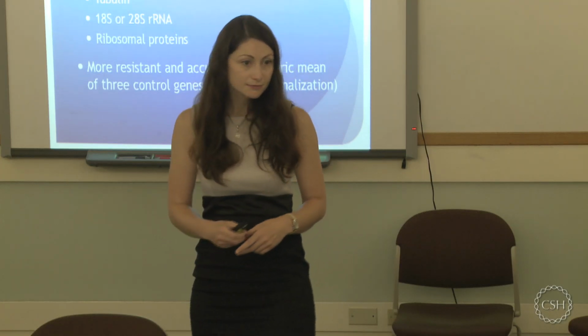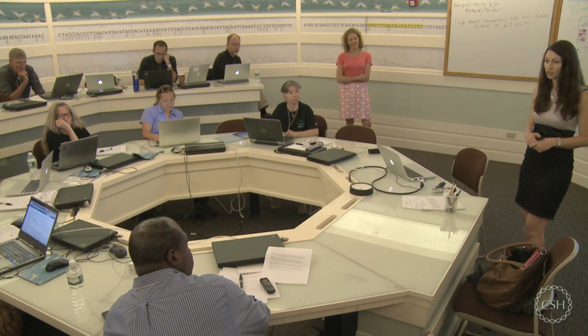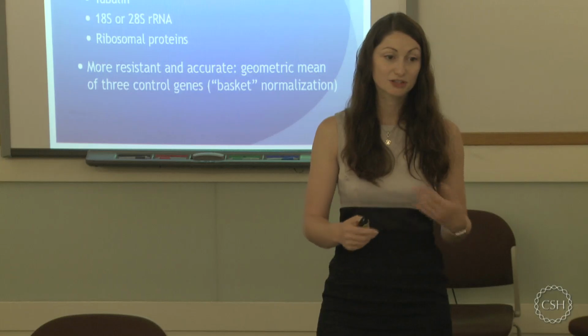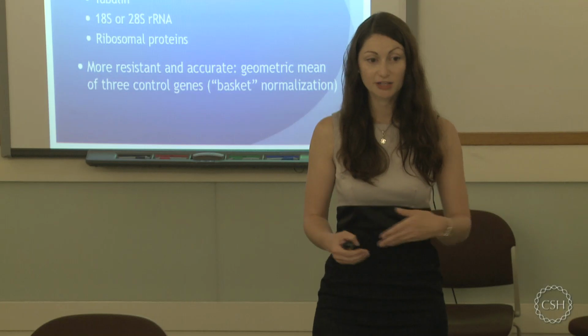This is for you're doing RNA or the cDNA? For the RNA. For the cDNA, you cannot necessarily measure the concentration because you have your primers in there and your dNTPs which have not been used. So it's difficult to afterwards estimate how efficient it was. You can only really estimate by diluting your RNA and then running a qPCR.